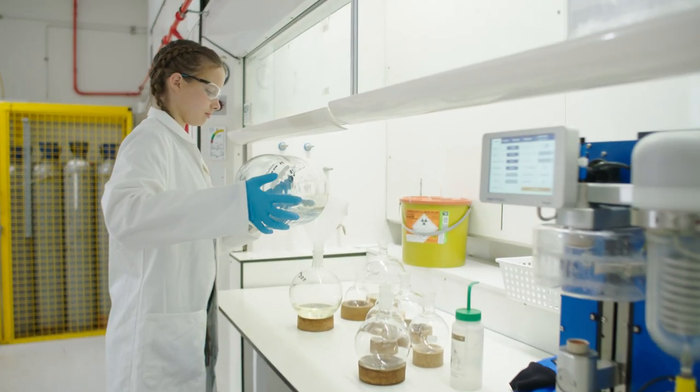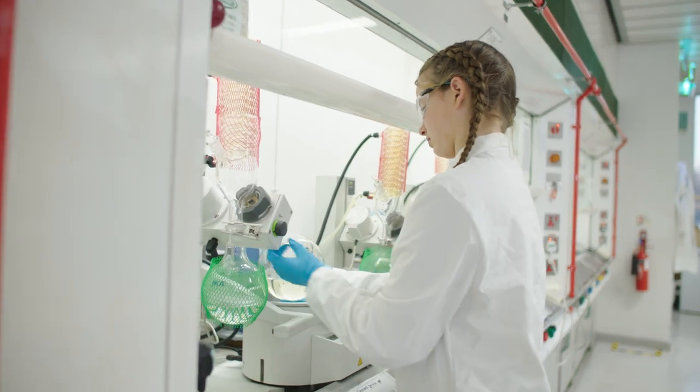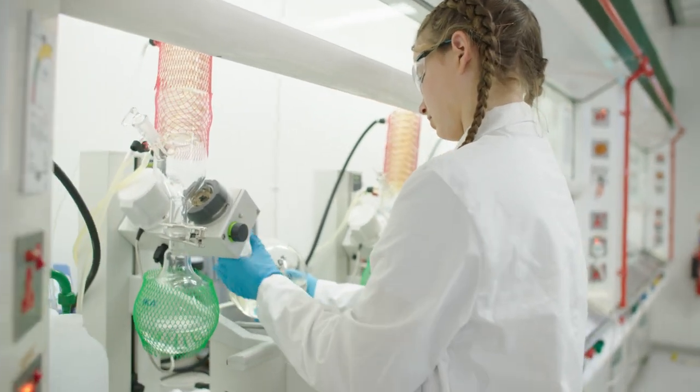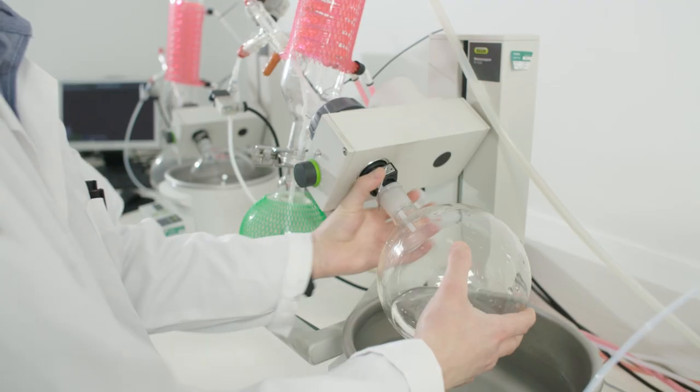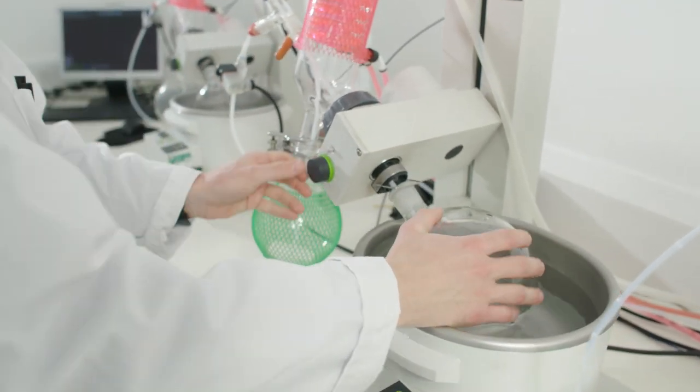We use a technique called chromatography, including liquid chromatography or HPLC and supercritical fluid chromatography. When REACH started, not many people in the UK were using SFC routinely as a separation technique. It's more common now, but we're still known for providing that turnaround really quickly.